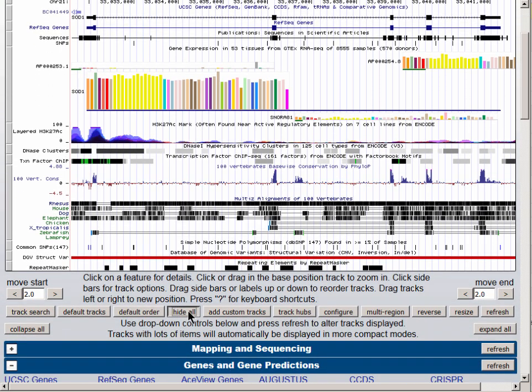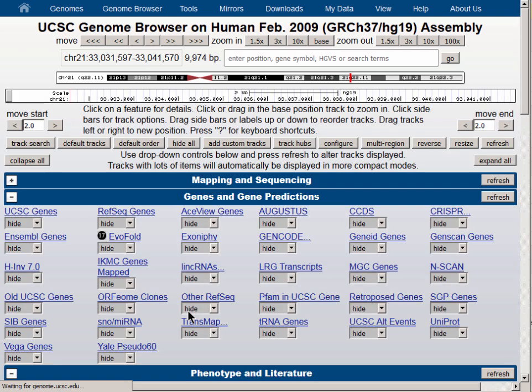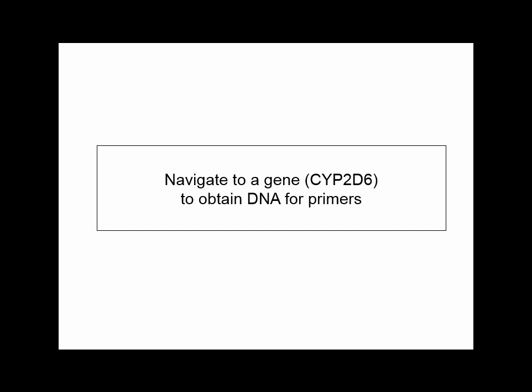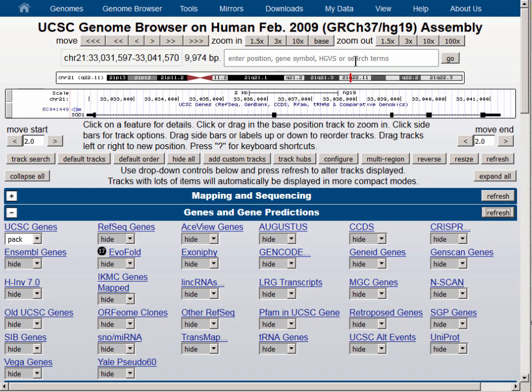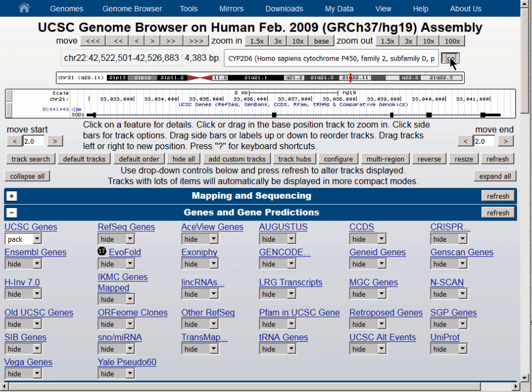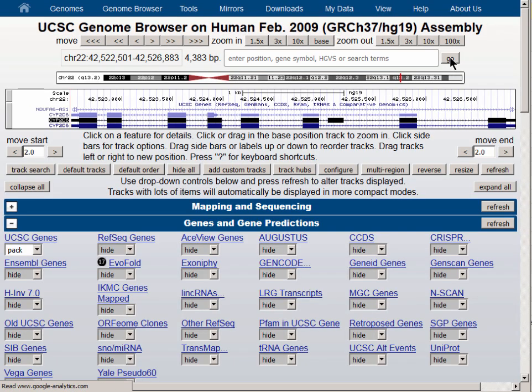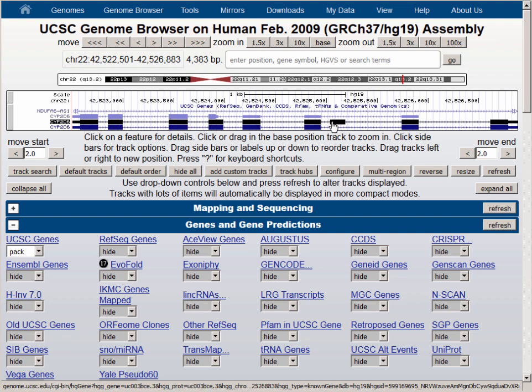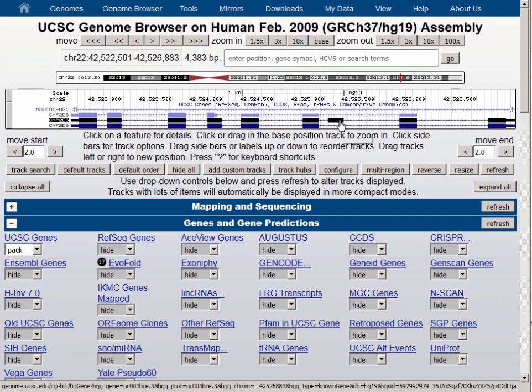Below the graphic, find the Hide All button to turn off the numerous data tracks visible, and set the UCSC Genes track to Pack. Let's navigate to the CYP2D6 gene — choose it from the drop-down suggestion menu and hit the Go button to navigate there. We are in chromosome 22. The reason for choosing this gene is that there is a very obvious differentially spliced exon in the middle of the gene, which allows us to use the in-silico PCR tool in both of its modes, which are essentially using either DNA or spliced RNA as template, so that you can see the results of the experiment both ways.